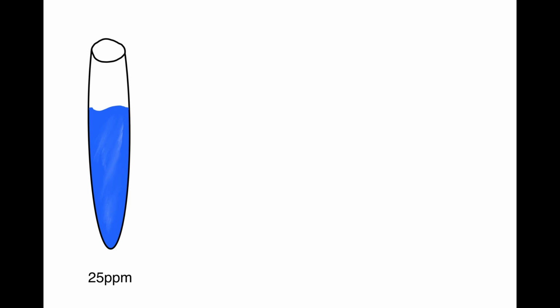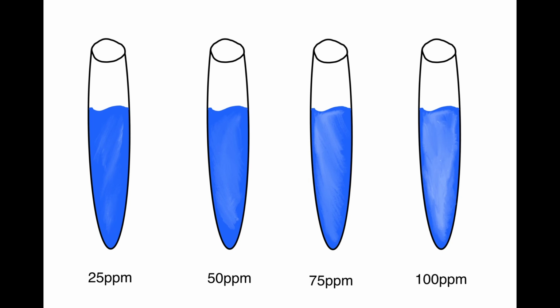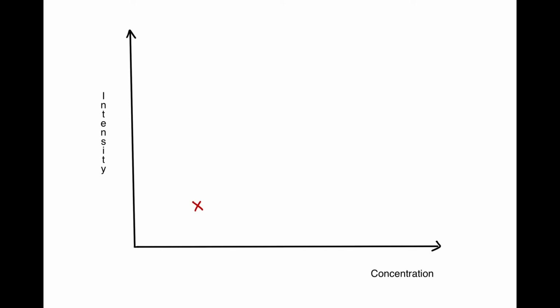Before carrying out a sample, the ICP-AES machine is calibrated using solutions of known concentrations. This creates a calibration graph which shows the relationship between the intensity of light emitted at specific wavelengths and the concentration of the element in the solution. This graph is then used to determine the amount of the element present in the sample itself.